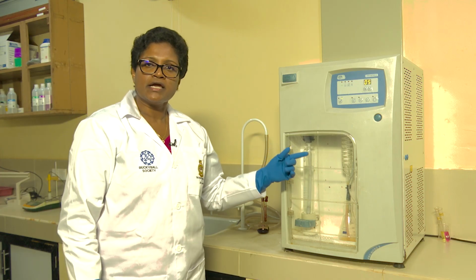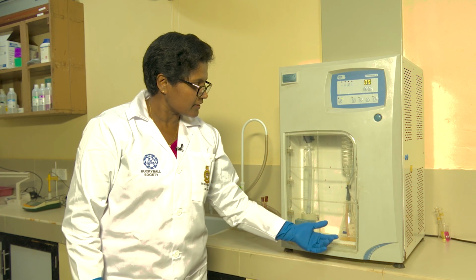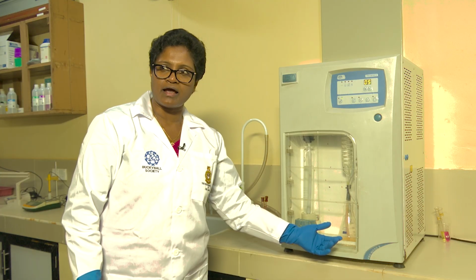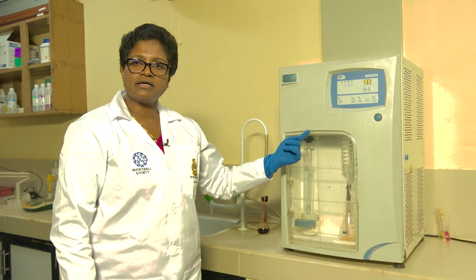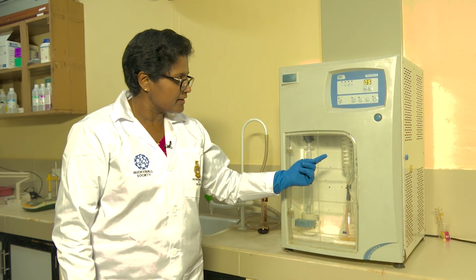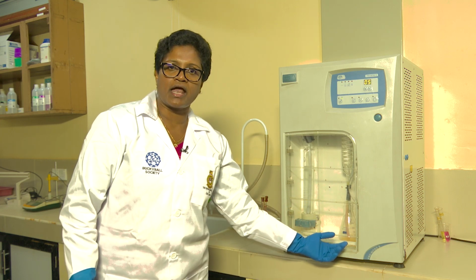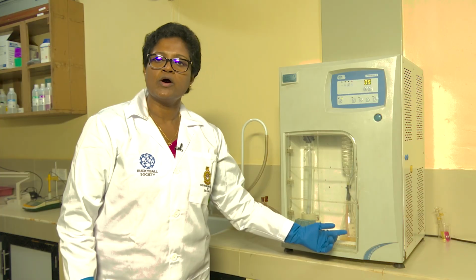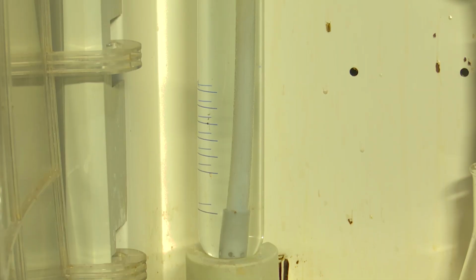Initially you observe the pink color in the titration flask because of the boric acid, the acidic color of the indicator methyl red. However, when the ammonia is liberated and comes through the condenser, it is trapped inside the boric acid, and you observe the color change from pink to yellow, the basic color of the indicator.